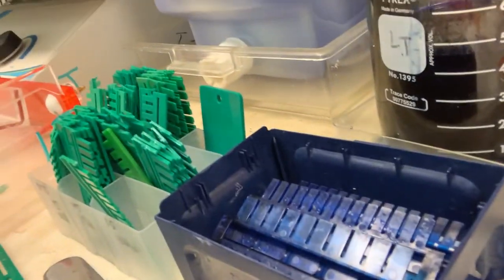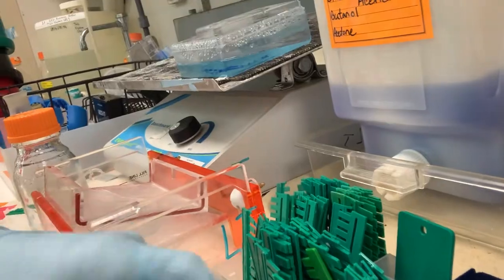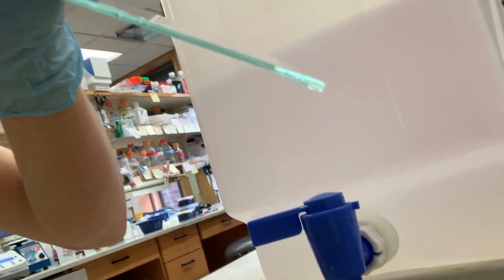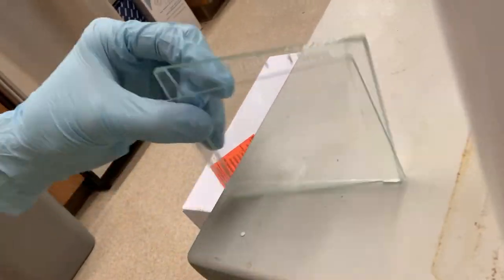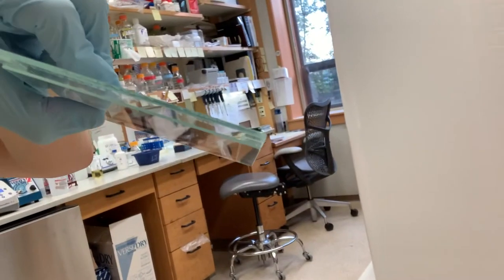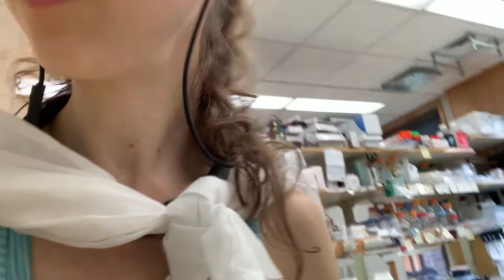We have a bunch of comb options — 0.75 mm thickness and 1.5 mm thickness, determined by the glass plates. You can also choose the number of combs. For setup, you have the glass plates — a short one in front — and you put them in casters and pour the gel in between in the slot, then let it polymerize and harden. Then you can move your protein through them.